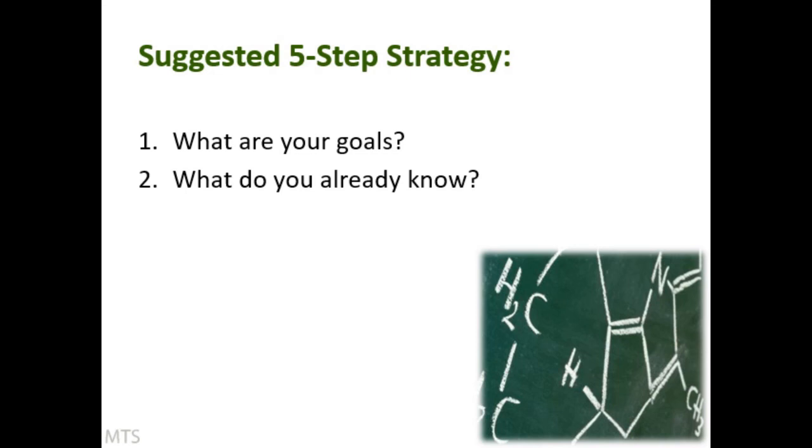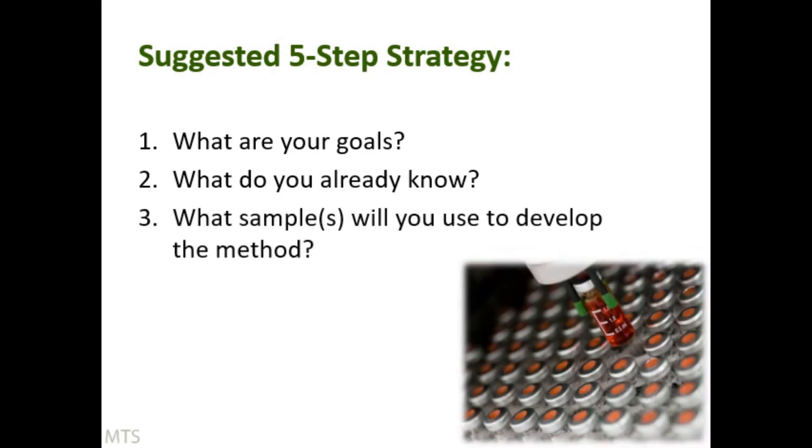The next one we haven't really touched on, we're talking about strategies, but this is just about something to inject. We need a little vial here to put onto our system to inject. So we do have to think about what will be in that vial. So we want our analytes in there, yes, but we also want interferences. So very often there isn't a single vial that you just inject and develop your method. Very often there's 2 of them, or maybe even more, that allows you to pick and choose which things you're interested in.